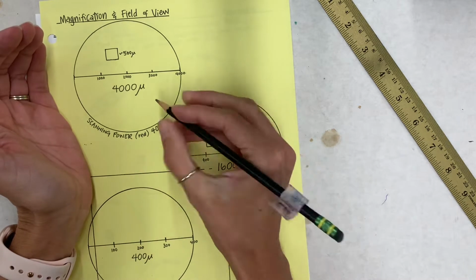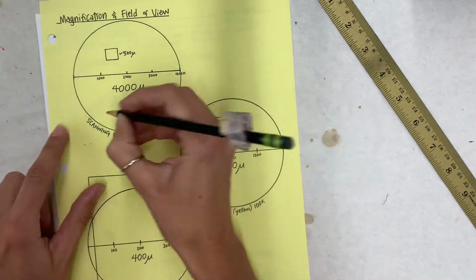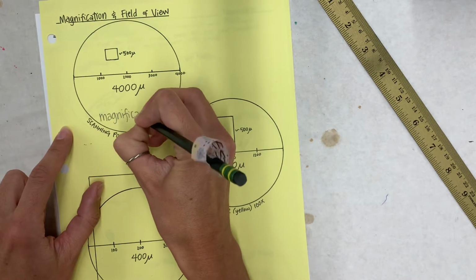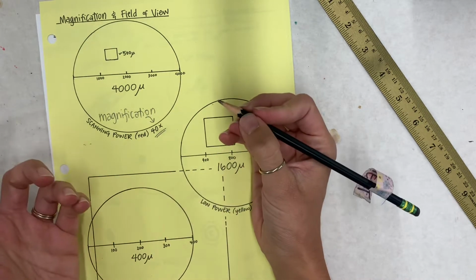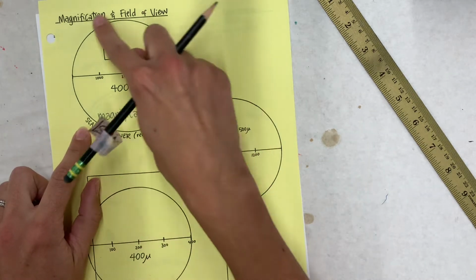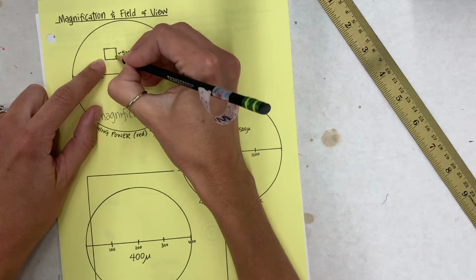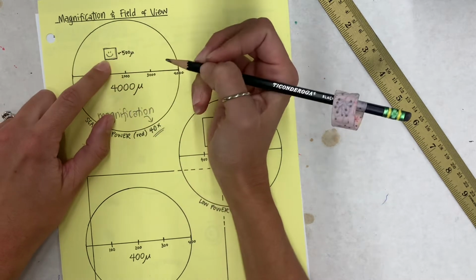And whenever we're viewing something with the microscope, we always want to start on the lowest setting, which is scanning power, and it magnifies our specimen by 40 times. So that is the magnification, 40 times bigger than what we would see with our naked eyes. Once it's focused on scanning power, let's say we're looking at this specimen here. This little guy is something we're trying to get a closer look at.